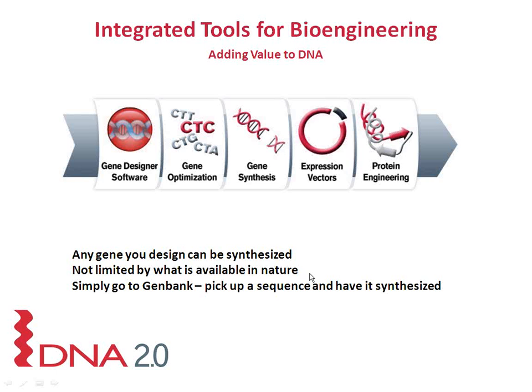So why gene synthesis? Any gene you design can be synthesized. You're no longer limited by what's available in nature. Large amounts of sequence information are becoming available in GenBank every day. With gene synthesis, you can simply go to GenBank, pick up any sequence you want, modify it any way you want to, and send it to us for synthesis.